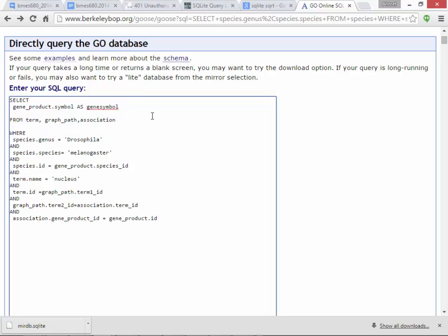All right. Okay, so what do we do? It says there's an error and we cannot find any obvious errors here. Can you see any obvious errors? Yes. Do we have to do anything with gene symbol that adds, or is that just for displaying it? So this one, we don't need to do anything.